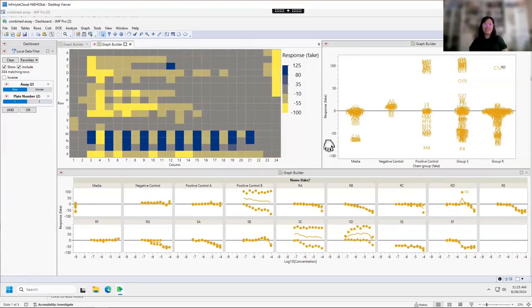And finally, I just wanted to say that even though this may seem like a really simple idea, just putting together Graph Builder panels, it ended up being a really effective and useful tool in revealing insights into the data that we would have missed otherwise. So make sure that you play around with dashboards.